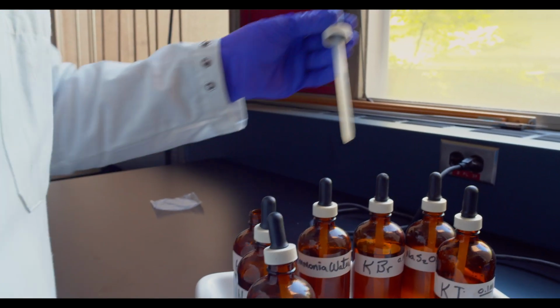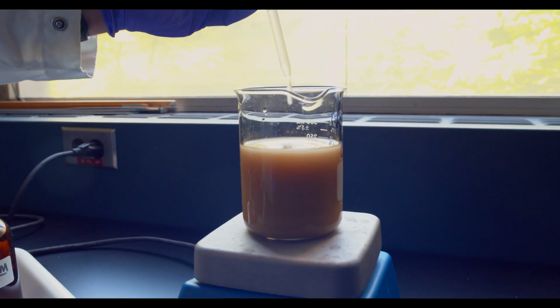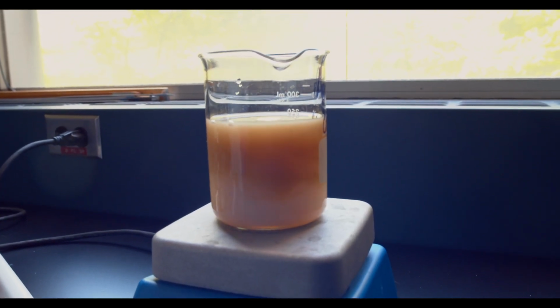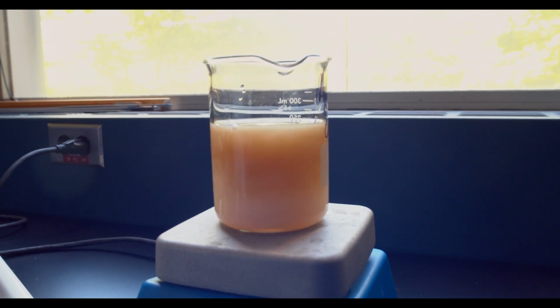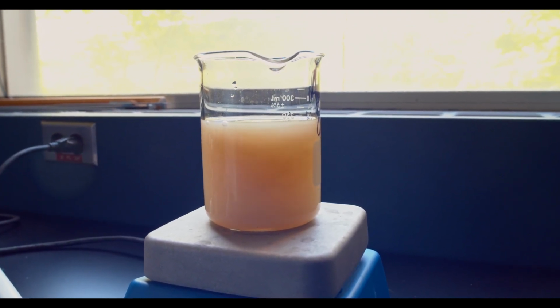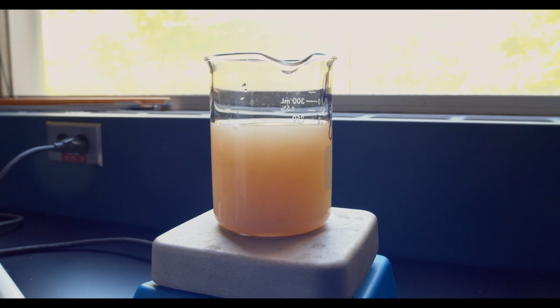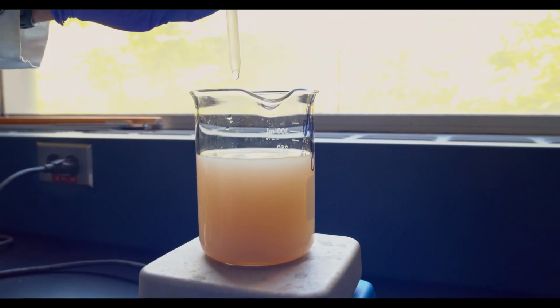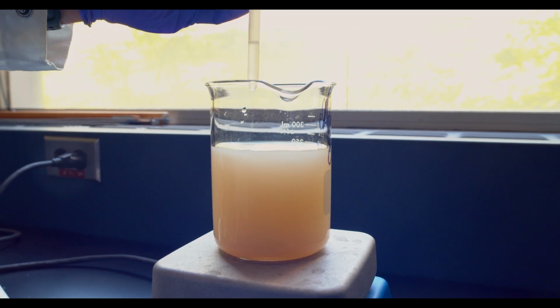Next we're going to add hydrochloric acid. You can see the brown color disappearing as the silver oxide is displaced, forming silver chloride.